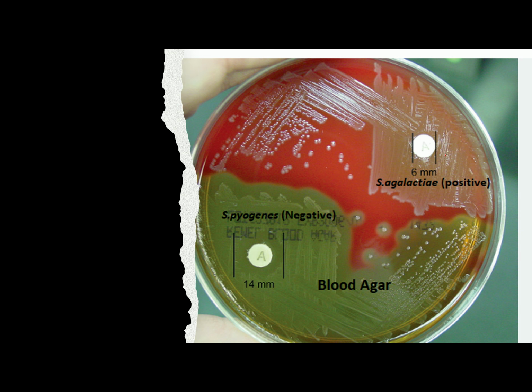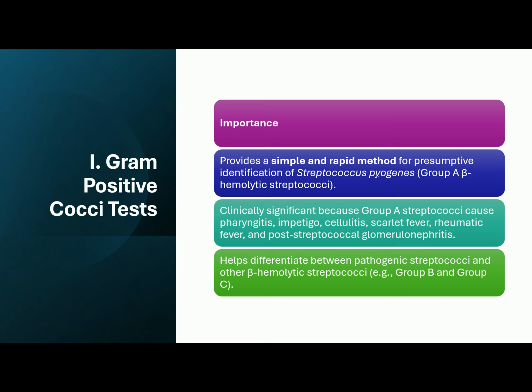So if you take a look at this, class, this is your S. agalactiae, which usually shows a resistant pattern. So ayan siya. Very, very small or no zone of inhibition. But if you take a look at the Streptococcus pyogenes, sensitive siya. It has a 14 millimeter zone on a blood agar plate.